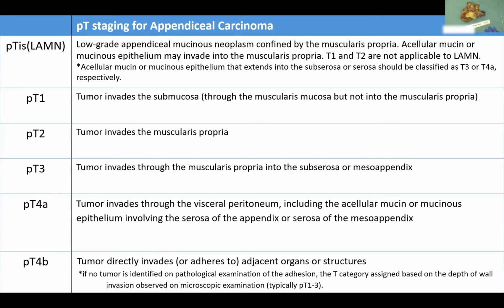But yeah, it makes for a challenging thing, because not only are you looking for any malignant epithelium, but you're also looking at where they are, right? Because depending on where they are, if they're found in the serosa, then you're into the T4 stages. And that's why it's important to ink the outside as well. And that's why I was a bit panicking there when a bit of that mucin stuck to the serosa of the small bowel. But then, thankfully, I remembered, oh yeah, it was inked.